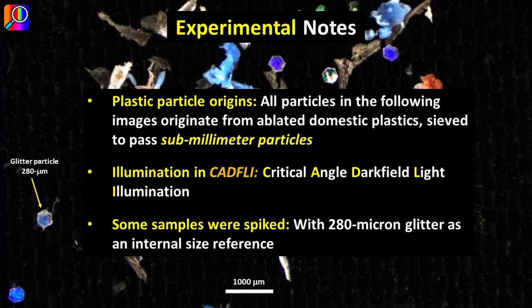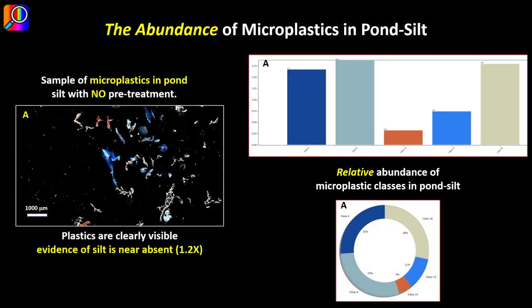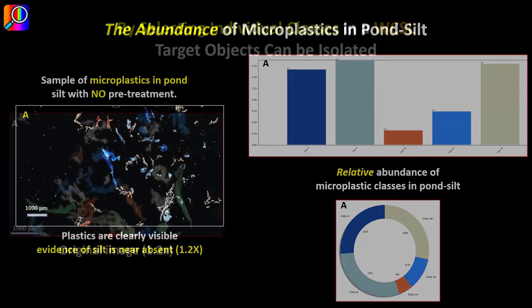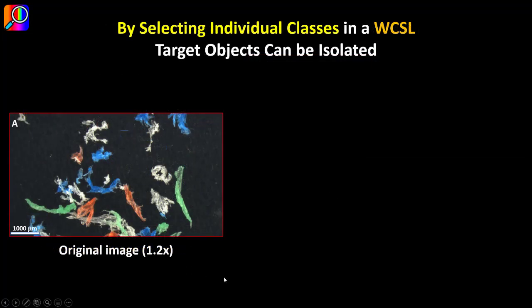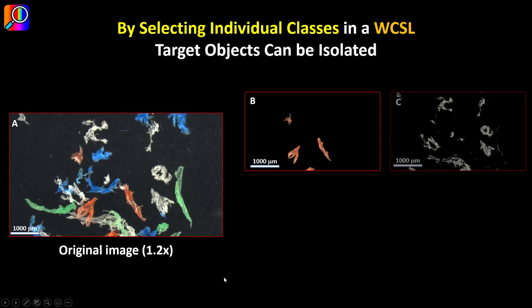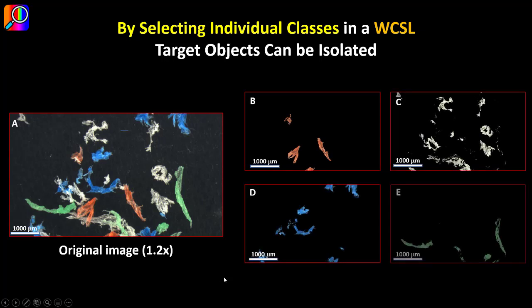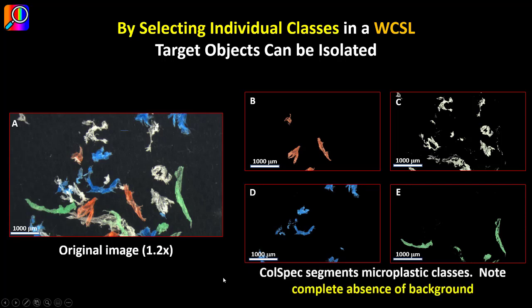All the plastic particles shown in the following images originate from ablated domestic plastics. They were sieved to pass submillimeter particles, and all samples were illuminated in critical angle dark field illumination. Some samples were spiked using 280 micron glitter as an internal size reference. This sample of microplastics in pond silt is without pretreatment and shown in cadfly illumination. Plastics are clearly visible and evidence of silt is near absent. The abundance of plastic classes are shown in histogram and pie chart formats. By selecting individual classes in a working color spectral library, target objects can be isolated. Notice that the background has been completely removed.